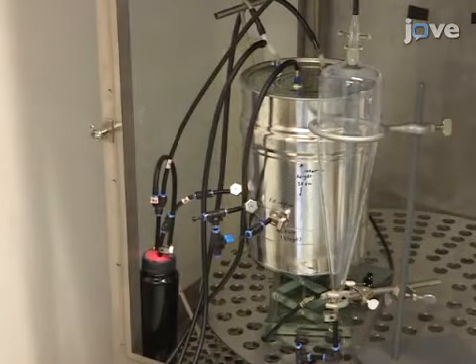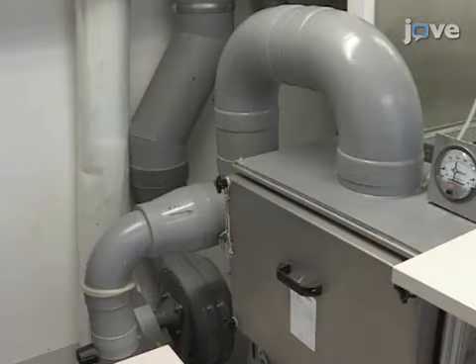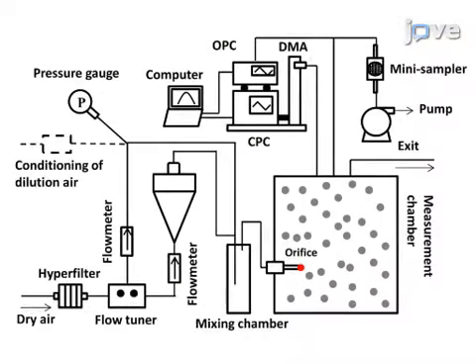More conductive particle tubing connects the mixing compartment to the measurement chamber, a grounded 12-liter metallic drum. Particle samples are drawn from its top. Extra flow is directed into a filtration system. This schematic provides an overview of the complete system.